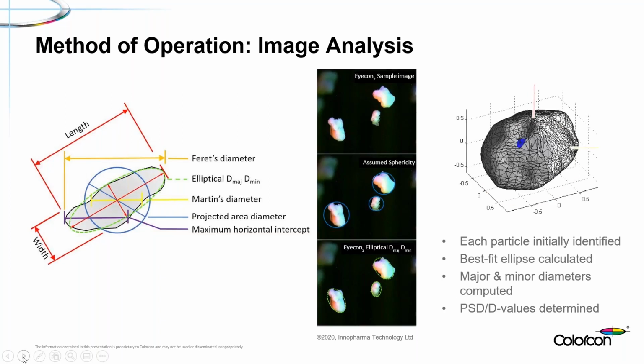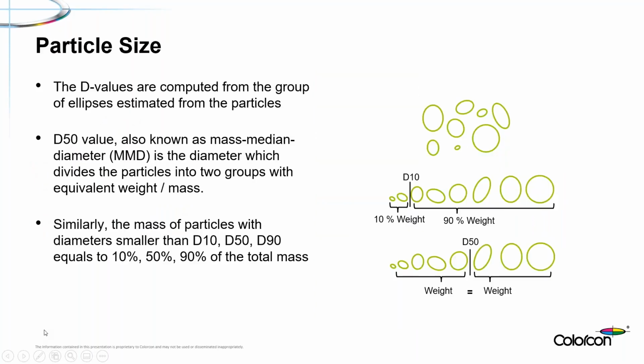There's just a very quick graphic there showing an ellipse fitting over a particle, which moved a little bit. I don't think we need to worry about that too much. And then I believe this is my final slide.